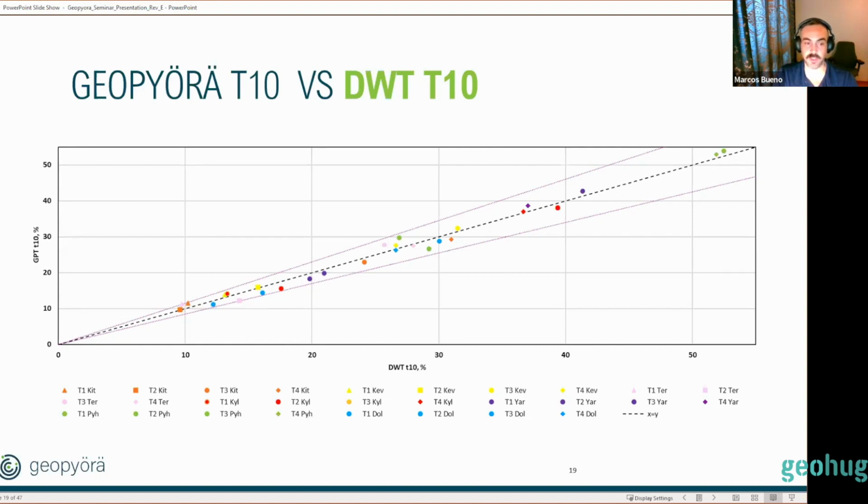But we need, by some means, to have an indication that the energy we're measuring was accurate. So if we measure 1 joule, is this 1 joule that was consumed in breakage real? To do so, we did that in an indirect way.